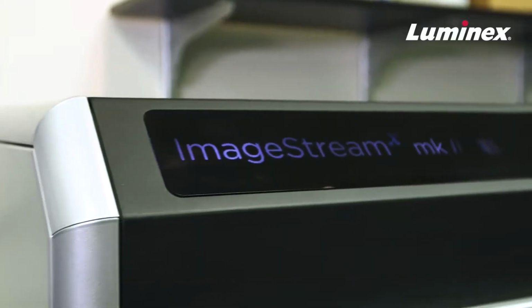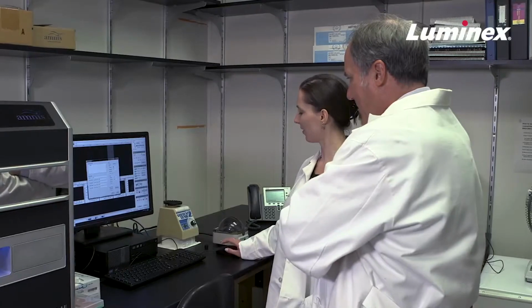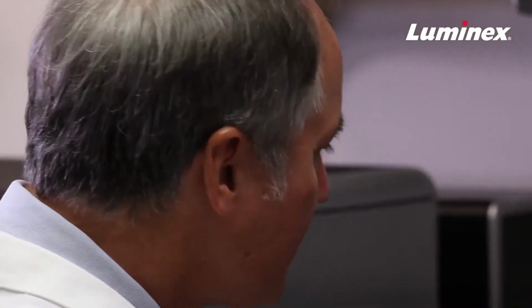One of the things that we adopted immediately to the ImageStream was doing the NF-kappa B translocation assay. Now before this, we were doing all that by confocal microscopy. And the issue there is that we had a technician who would spend a day counting 100 cells for each sample. So it was very laborious, very labor intensive. With the ImageStream, that became a completely automated analysis where we were able to acquire a lot of cells and really get some very statistically significant information from it.